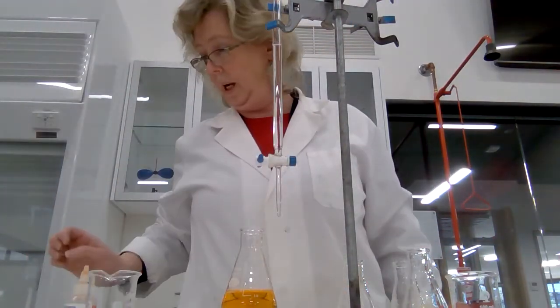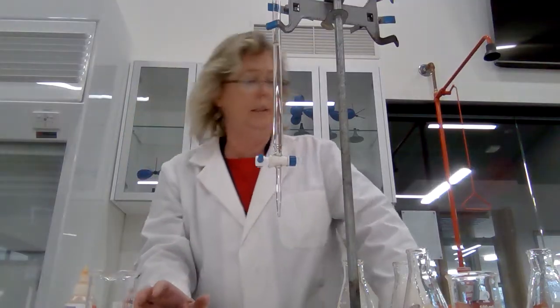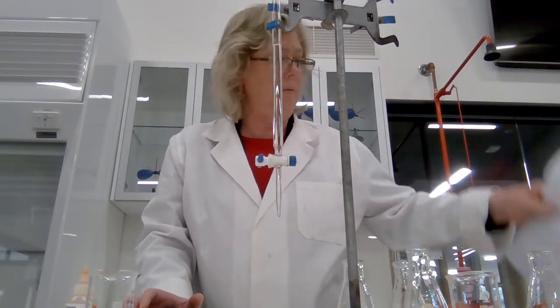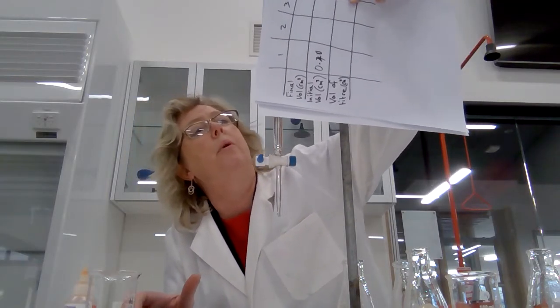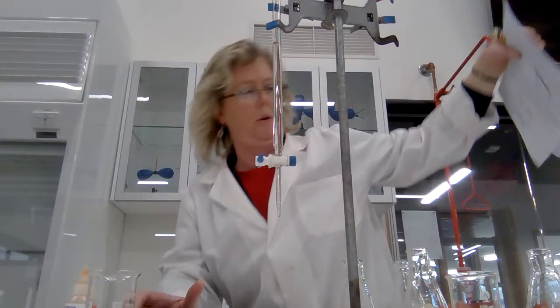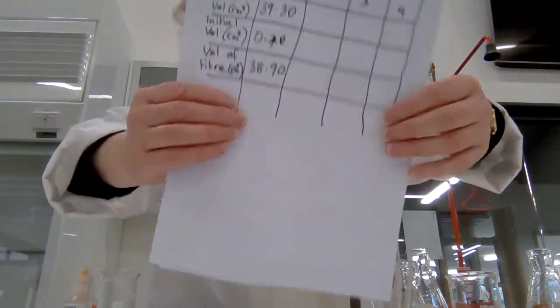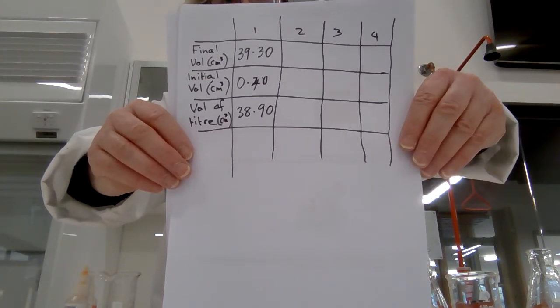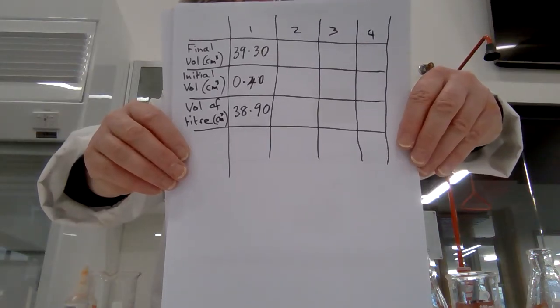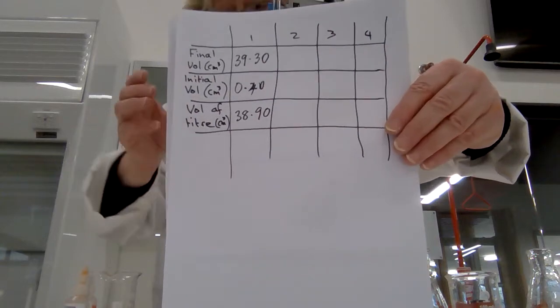Let's just pause and read the burette. The volume in this burette is 39.30. So what I've done is recorded it in my table of results and done the subtraction — final on top, initial underneath — and we've got our first value. I'm going to refill the burette.